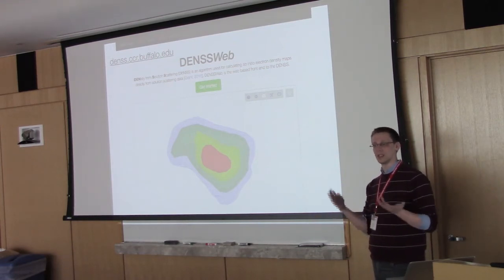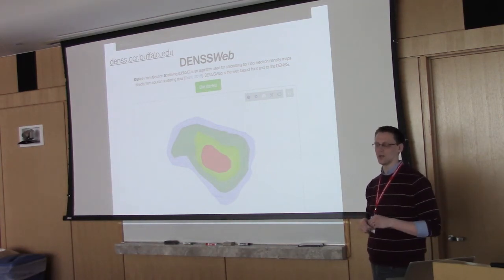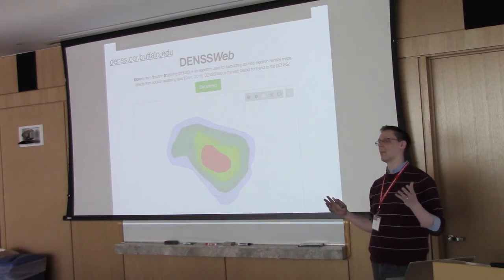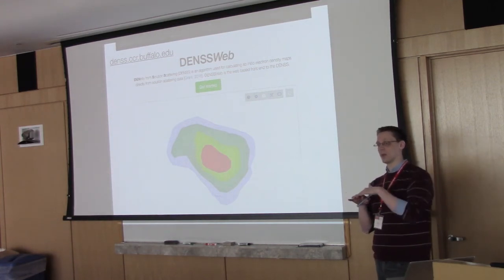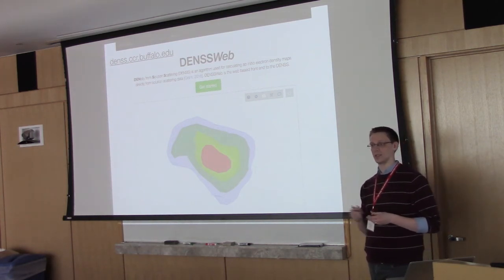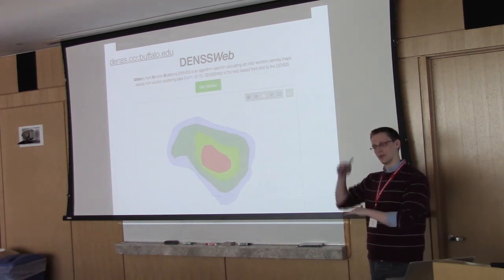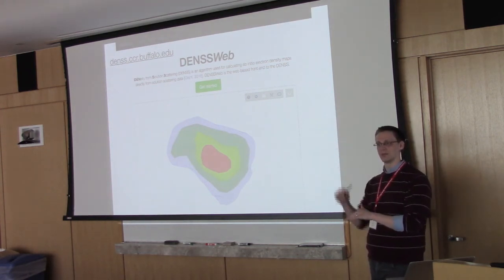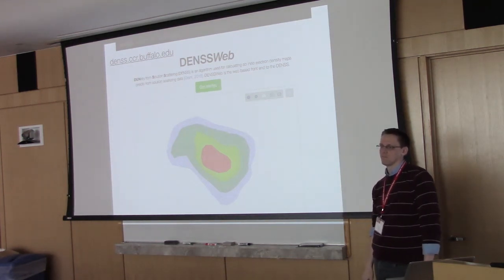There are some things you have to do to allow it to do that, like turning off solvent flattening, because the solvent's not flat anymore. But there's a version I'm working on that combines these two ideas so that you can actually model the solvent and model the protein simultaneously. This is the version that does this contrast matching with neutron data, because you have the same molecule, but different levels of buffer contrast. So that's the basic idea.